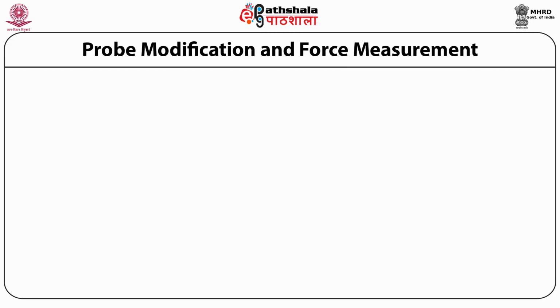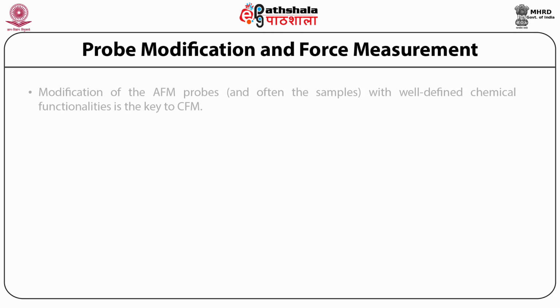This talks about probe modification and force measurement. Modification of the AFM probes, and often the samples, with well-defined chemical functionalities is the key to CFM.